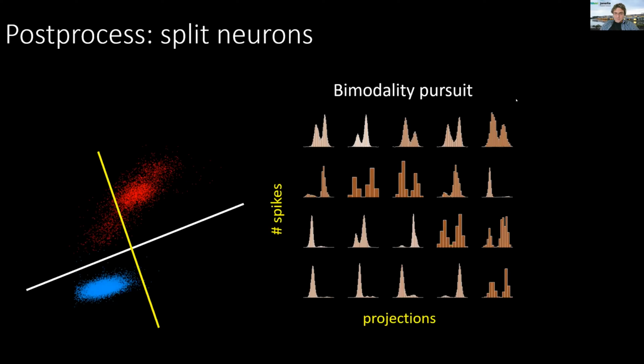Well, it's not a huge change. The 3 hertz is the first thing I would say. Second thing I would say is it seems like the kind of change where something about the thresholds could be changing, right? So you might want to look at your thresholds. If a neuron's spike rate increases or decreases, it could be because it's hitting this lower ceiling, which I think the default actually is different. The way we treat that lower ceiling is different in Kilosort 2.5 and 3. So it might just be that, which is not something about the algorithm itself.